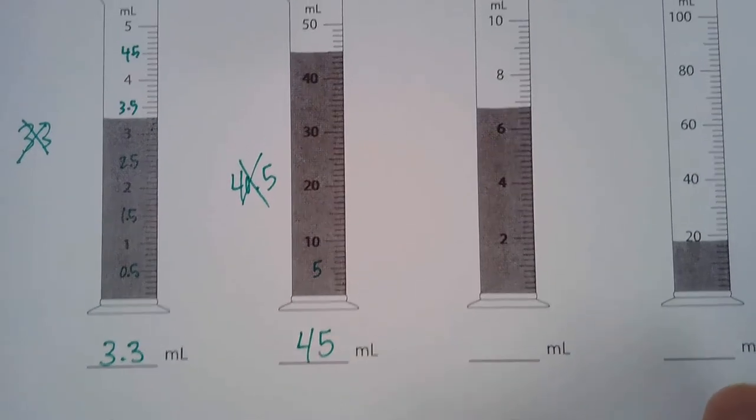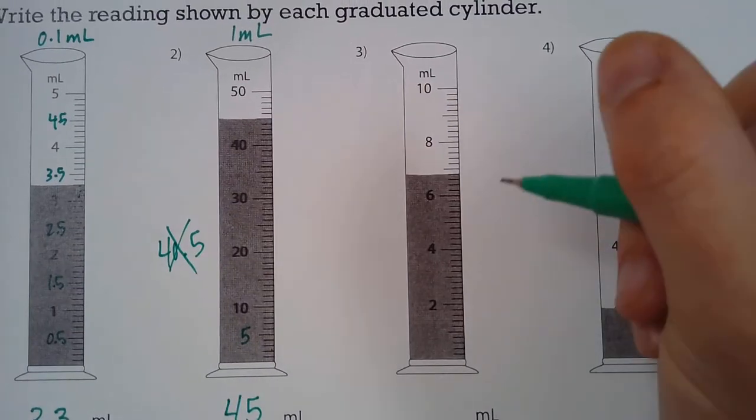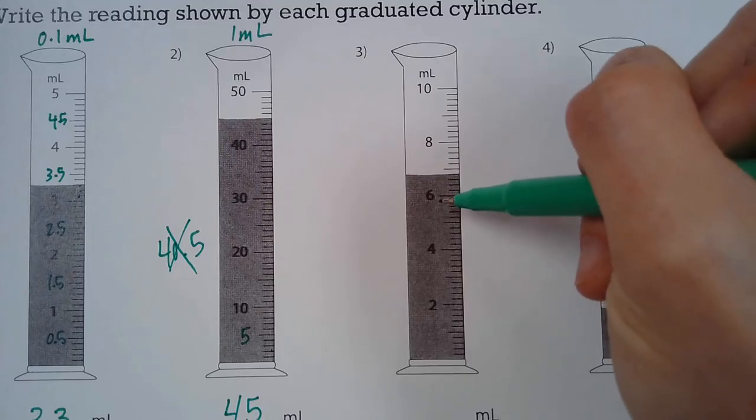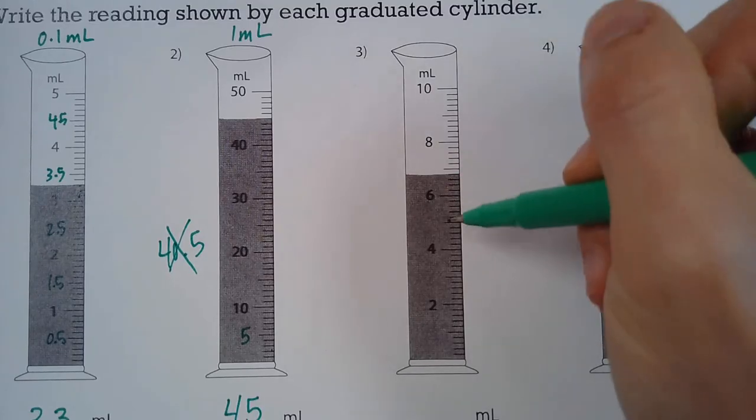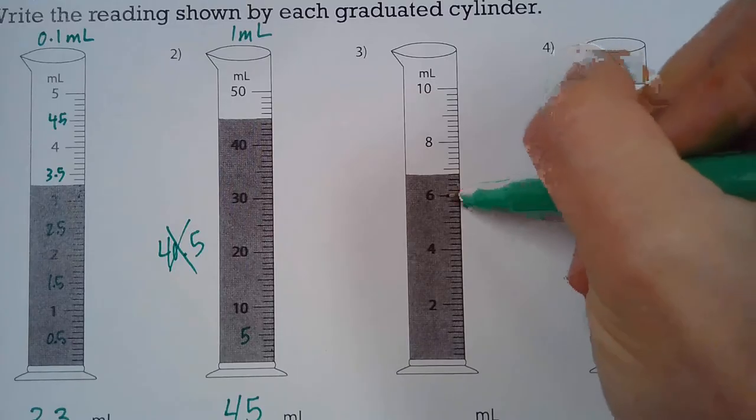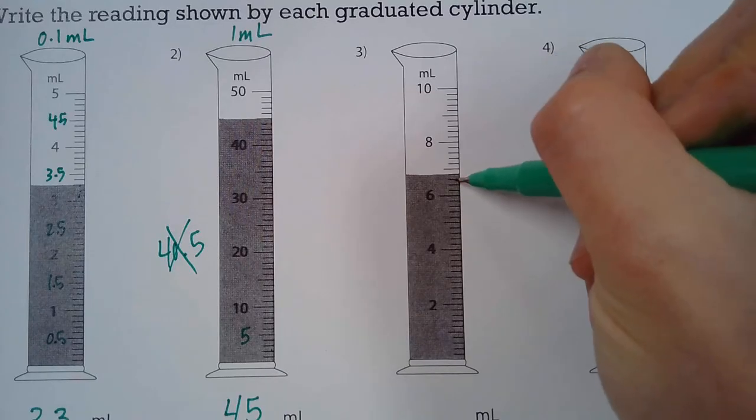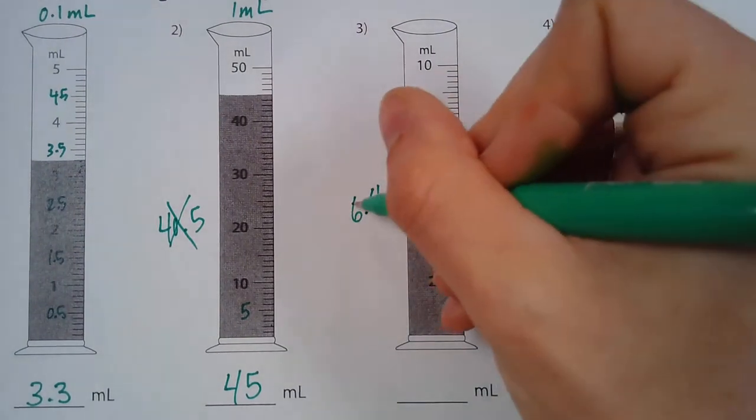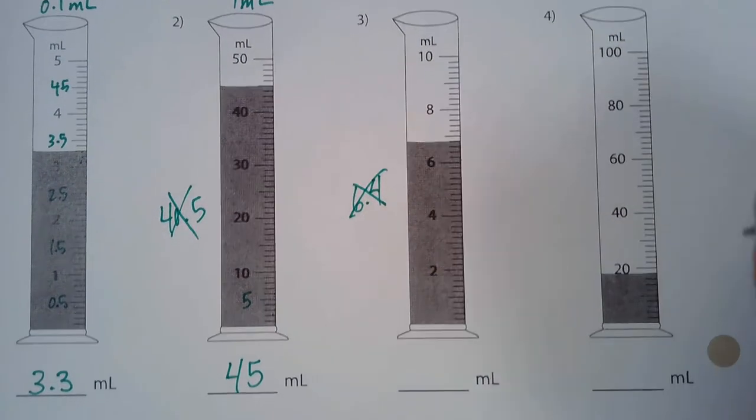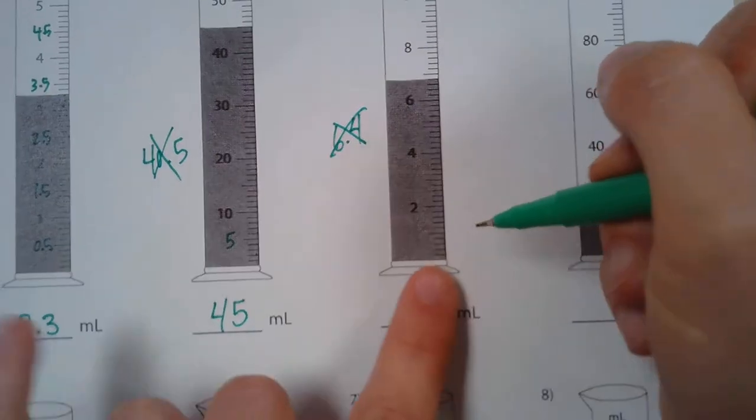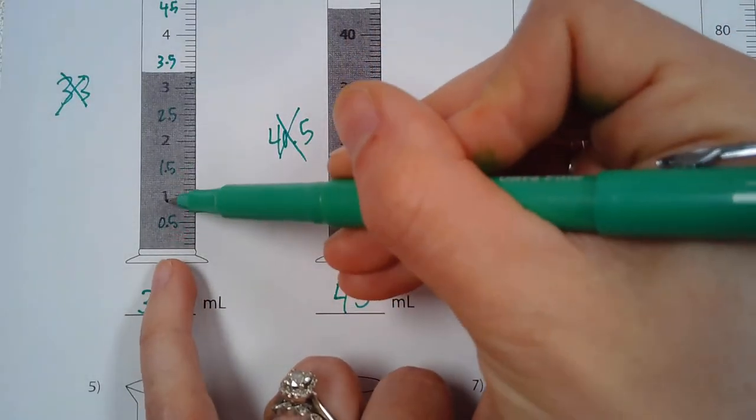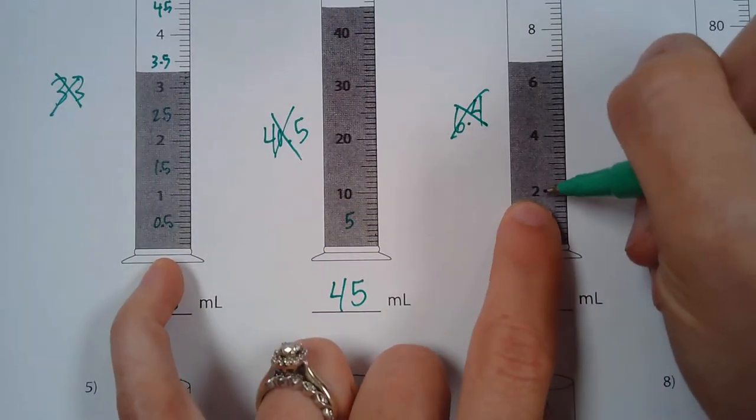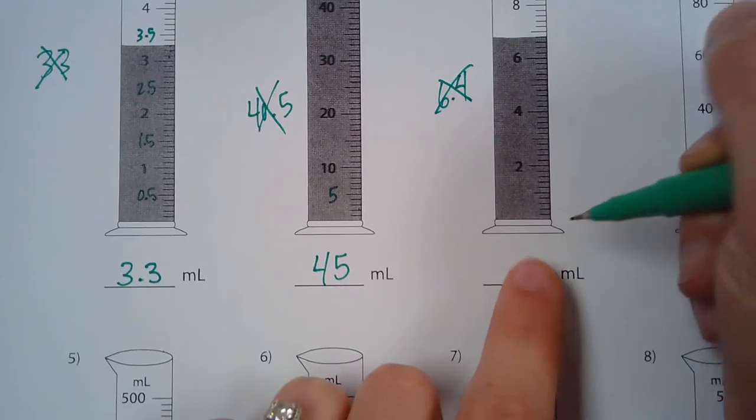Okay this next one a lot of students just look at it and they say okay well I know that it's not counting by ones but they think well maybe they're just counting by 0.1. So they say 6, 6.1, 6.2, 6.3, 6.4 and they say it's 6.4 millimeters. That would not be correct and here is why.